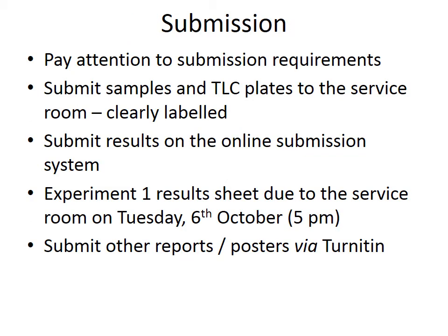Make sure you read carefully what you need to submit and where. When asked, submit samples and TLC plates to the service room, making sure that they are clearly labelled. You will be marked on the quality of your TLC plate, the appearance of your sample, and the yield of your sample.